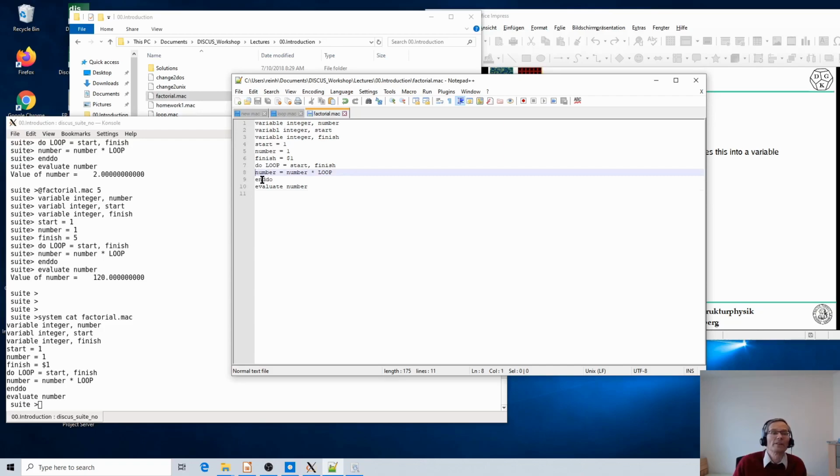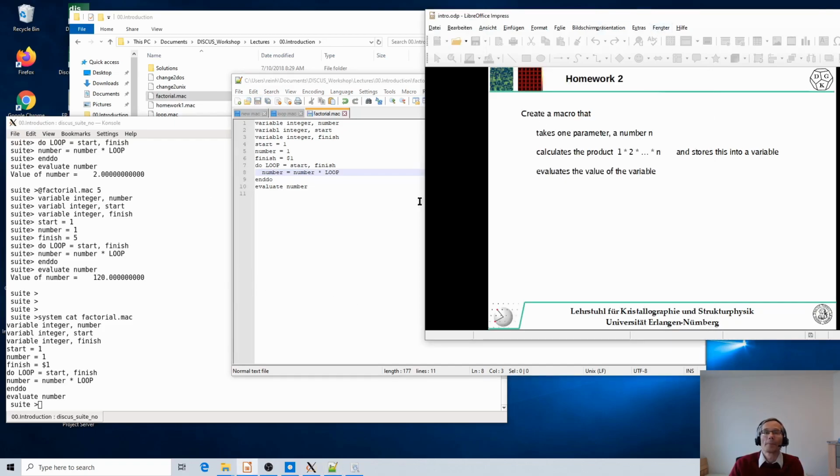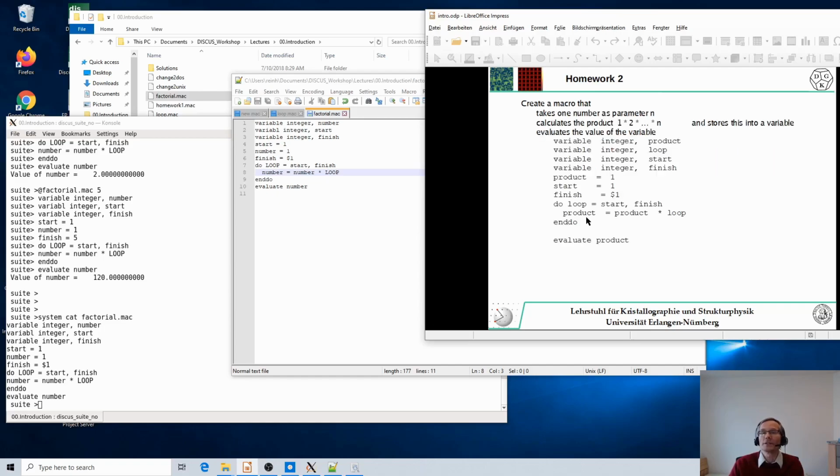If we indent these lines a little bit, it makes it easier to read, to see that this block from the do to the end do is a simple block. But it's not important, unlike Python, where the indentation is critical to the macro or to the script that you write. All right. If you now look here for the cheat, you see basically the same concept.